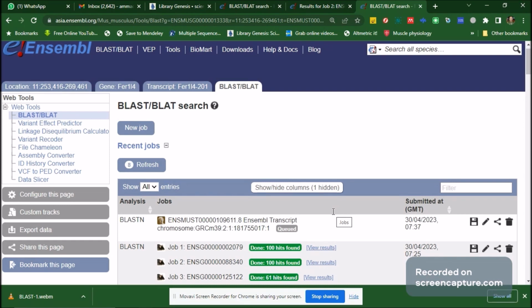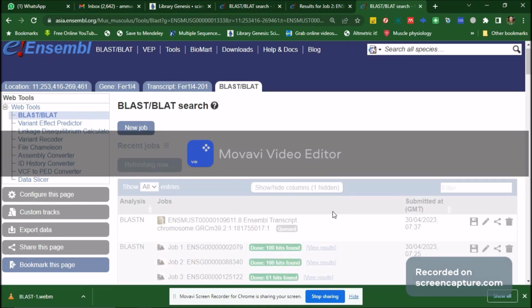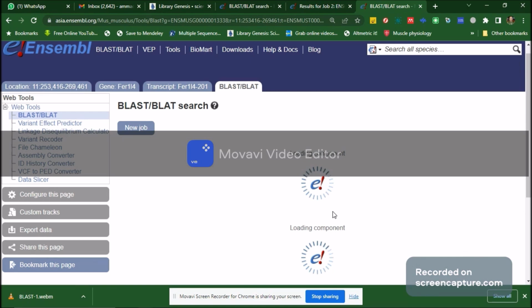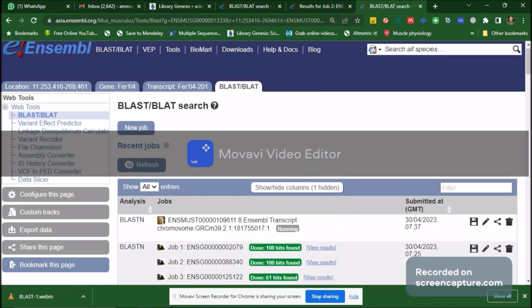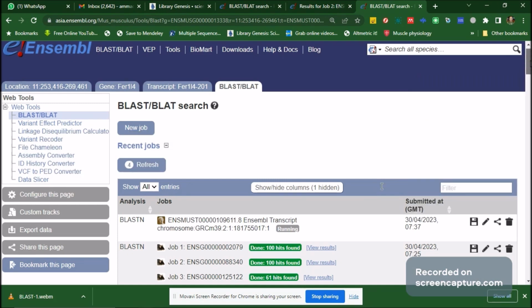The ortholog which you found after the first blast, when you blasted the human non-coding genes against the mouse, the ortholog you found, which was a potential candidate, must be a coding gene.